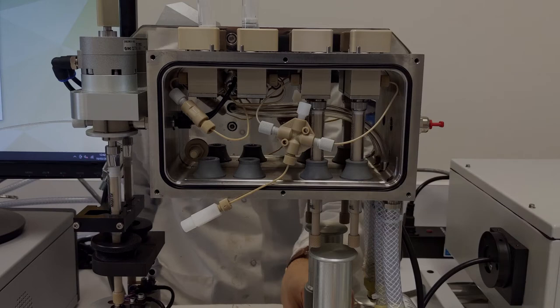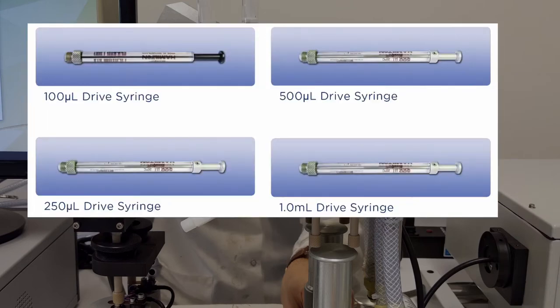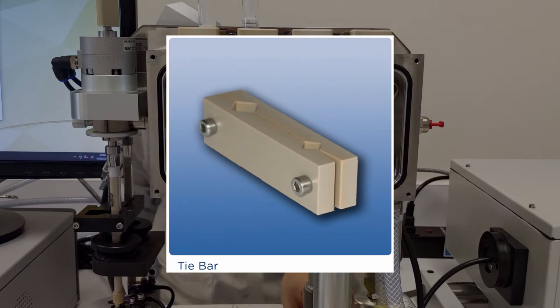Alternatively, if you are interested in asymmetric mixing applications for your stop-flow instrument, different volume syringes would be required. In that case, syringes would need to be replaced and a tie bar for appropriate pressure distribution installed.